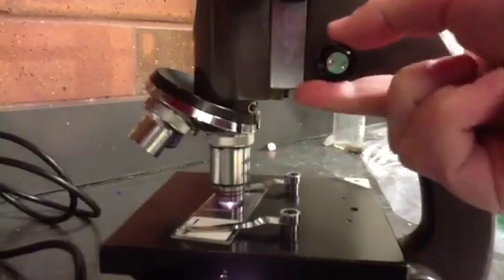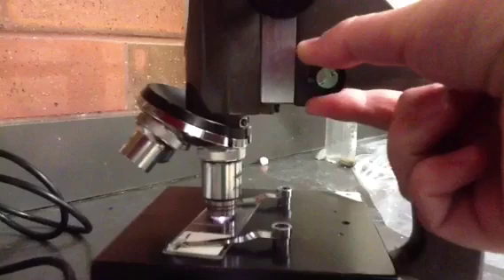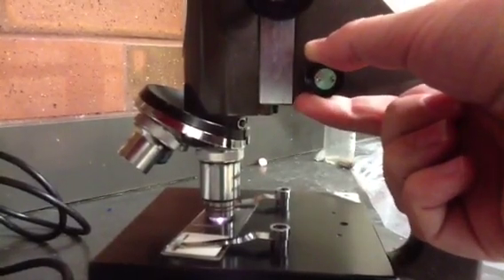So on this power, you only want to use the fine adjustment knob. Notice when I turn that, you don't see any movement in the lenses, but it will sharpen the image so that you can see it well.